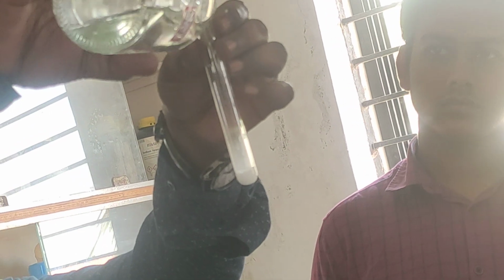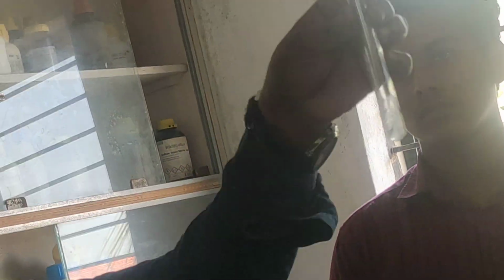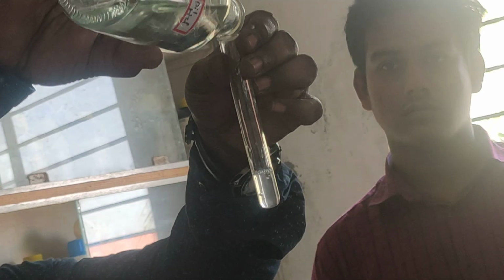If it is still not dissolved, add dilute HCl again. Don't add dilute HCl all at a time; you have to add it slowly. Now it is almost dissolved. If you add some more, the salt has completely dissolved. So this is the original solution. Now you got the clear solution. Keep this original solution aside, and with this original solution only you have to perform the experiment.